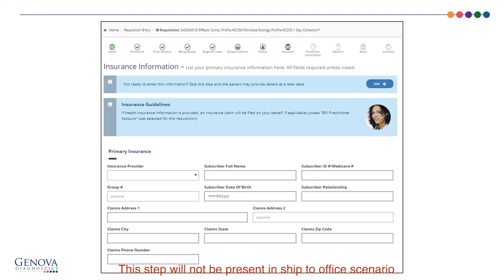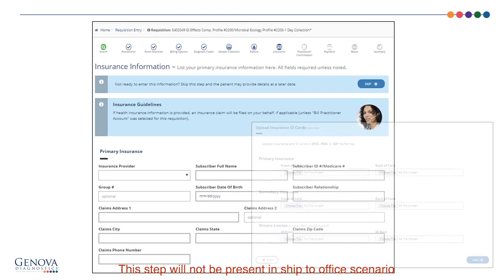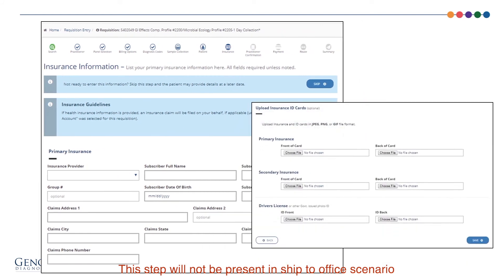The next screen is where you enter the patient's insurance information. You can skip this screen, which will send it to the patient to complete. After completing the primary insurance section, you can upload images of the patient's insurance card and driver's license.